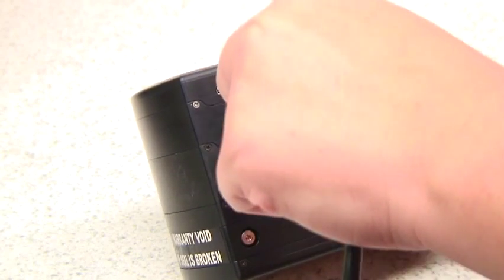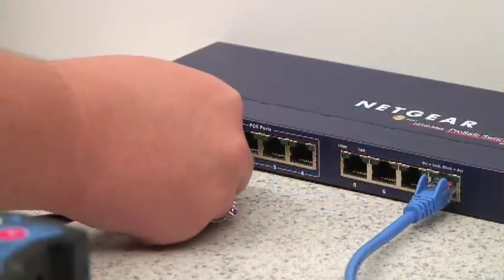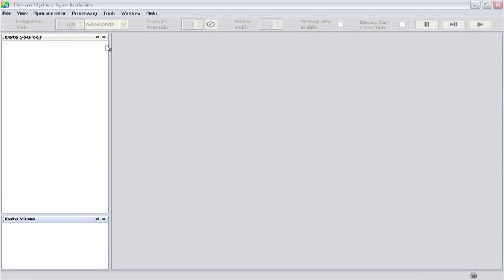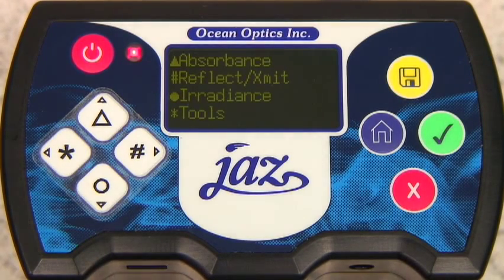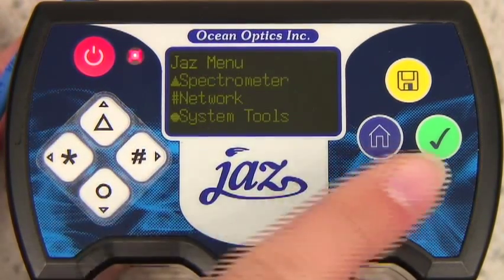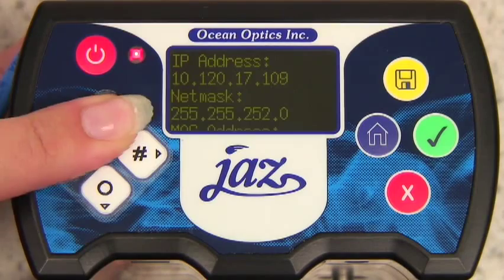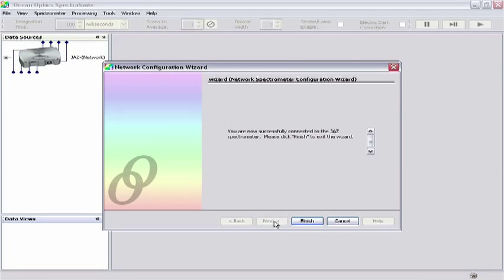Now, let's connect JAZZ to your PC through Ethernet. Connect the Ethernet cable from the JAZZ unit's Ethernet connector to a network hub. Turn on the JAZZ spectrometer and run Spectra Suite. Under the Spectrometer menu, go to JAZZ Network Spectrometer — here, you will be prompted for an IP address. To find the IP address, press the blue home button, then press the red X button. This will take you back to the JAZZ menu. From there, select Network and then View Settings. Your IP address will appear at the top of the screen. Insert the IP address into Spectra Suite and select Next. Your JAZZ spectrometer should now appear on the left-hand side of your screen.